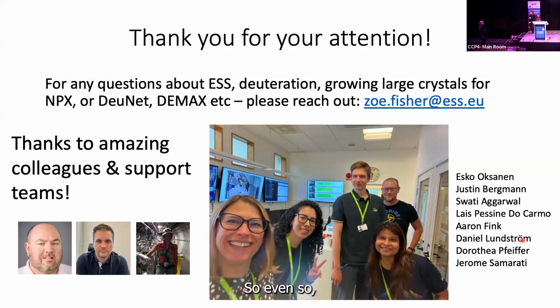Yeah. So, even with time of flight Laue, it still took weeks to collect a data set. So we really need, I think the flux is the key. Yes. And in the Laue side, how is the software? Because someone recently collected X-ray data with Laue data and went to look at CCP4, and the program had not been updated for 15 years or something. So it didn't work with the current data, and it was a pain to deal with.